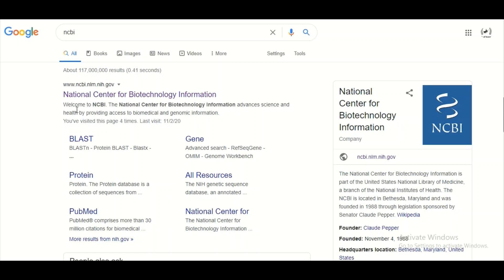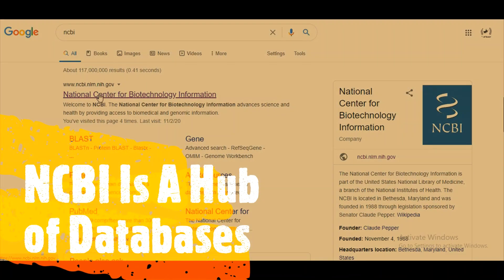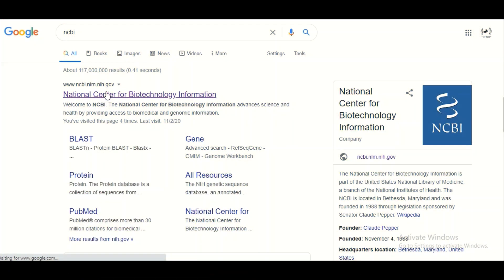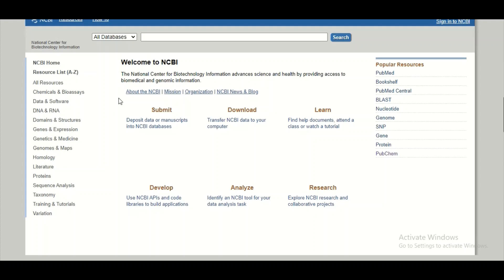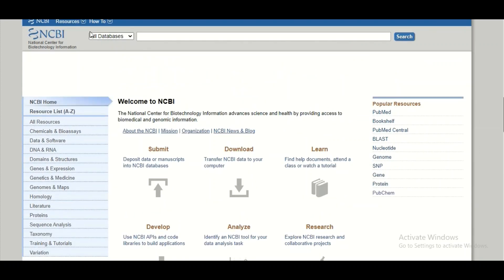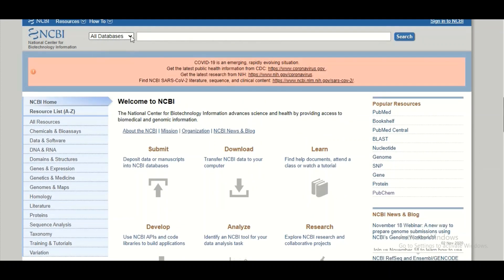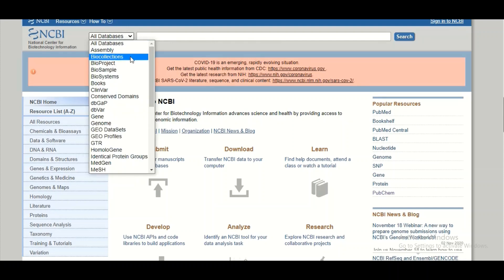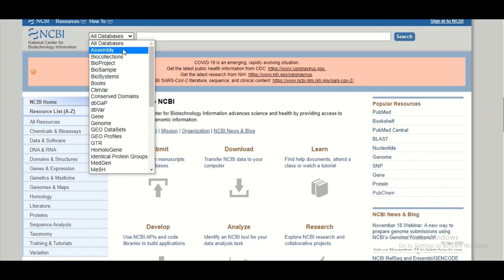Today we are going to talk about the Nucleotide database. This Nucleotide database is present in the National Center for Biotechnology Information, which is a hub of many different databases. To explore this database, we will click on the NCBI link and land on the next page, where there is a drop-down menu showing how many different databases are present in NCBI.